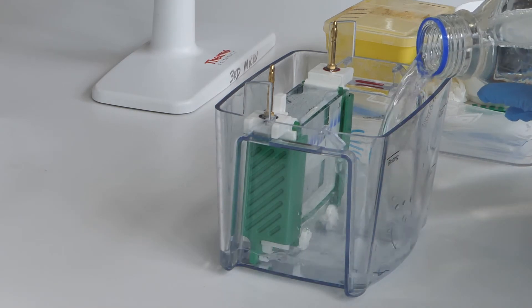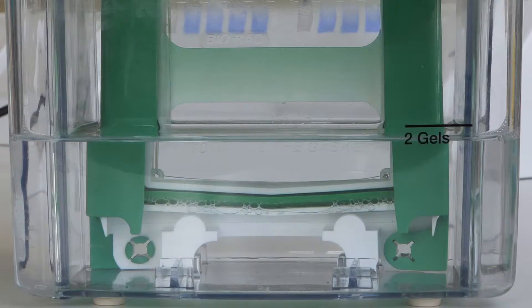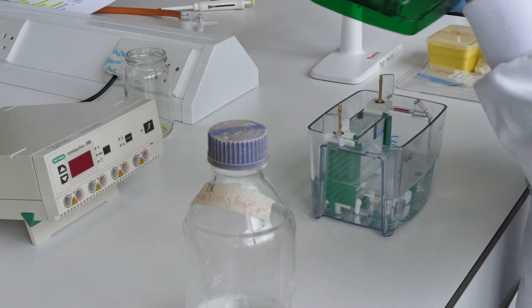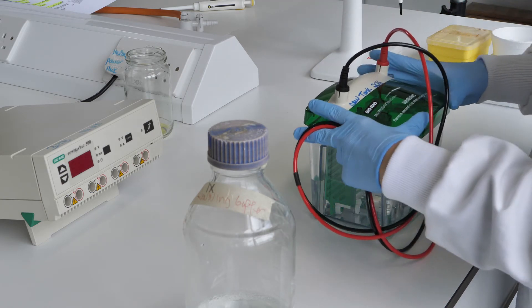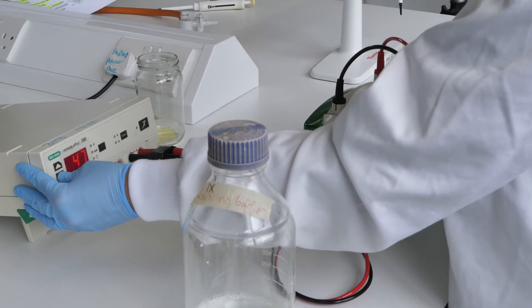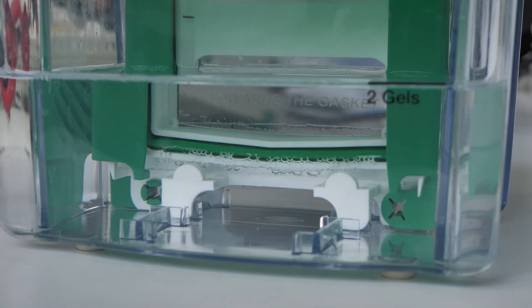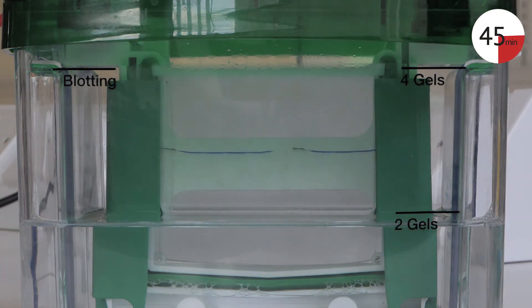Add running buffer to the gel tank until it covers the bottom of the gels and reaches the level marked for two gels. Once loading is complete, close the apparatus and connect to the electrical power pack. Set the gel to run for 45 minutes. After pressing start, check that bubbles emerge from the lower electrode and that the samples have begun to run into the stacking gel before you leave the apparatus.